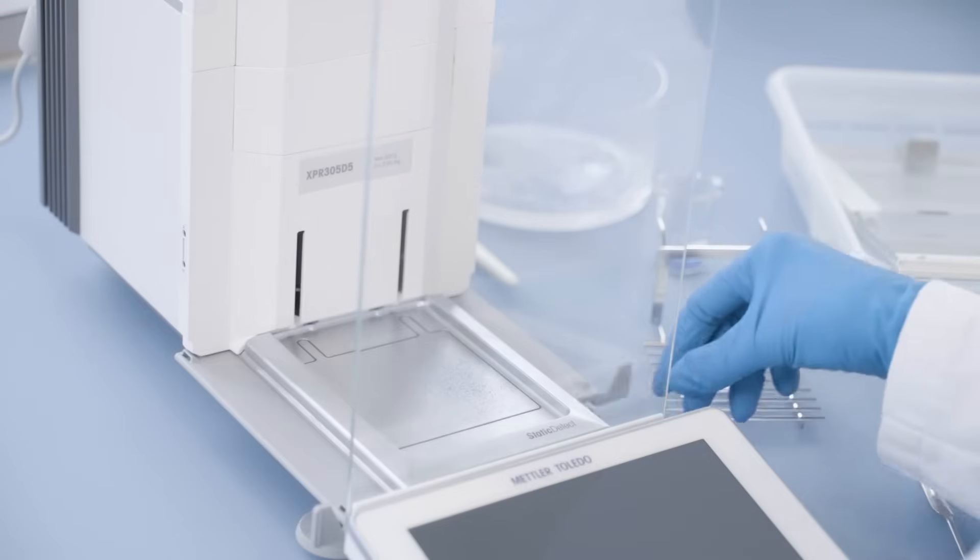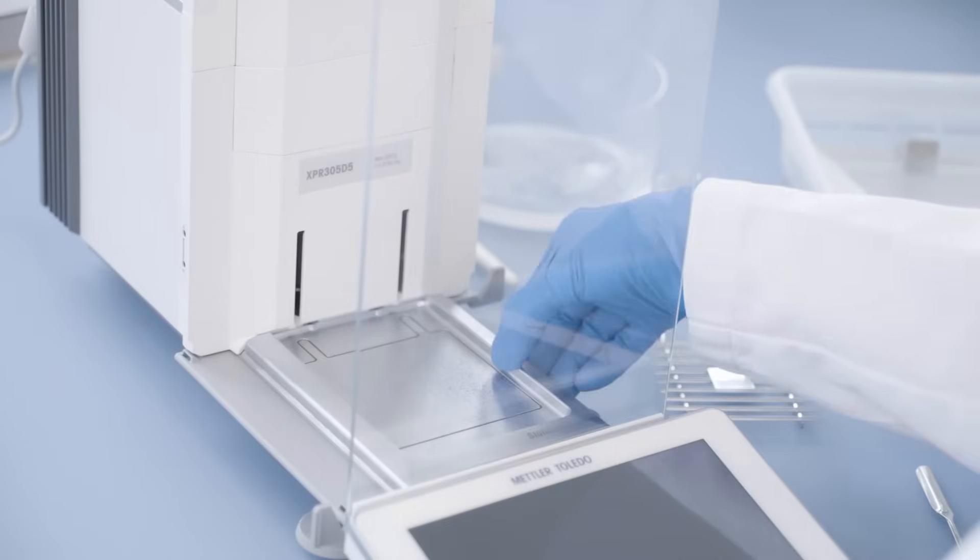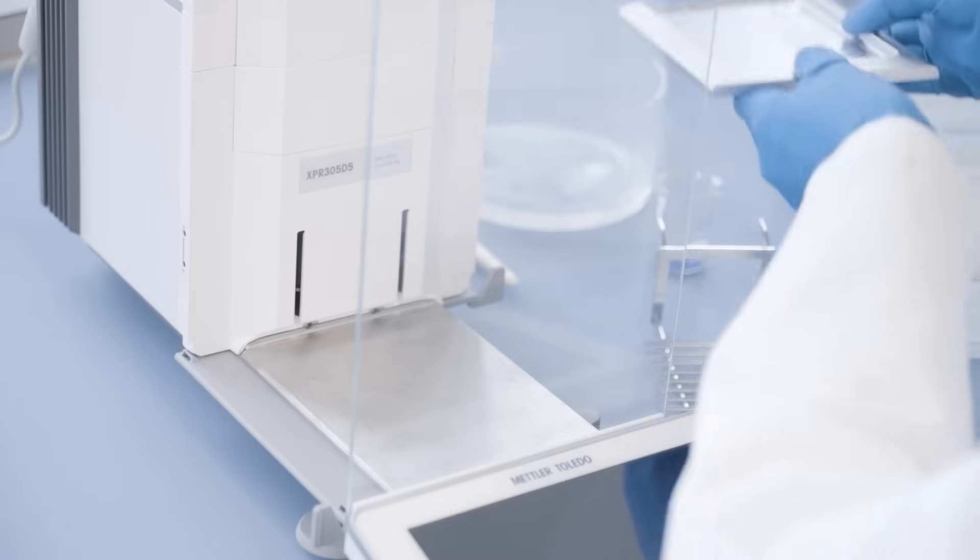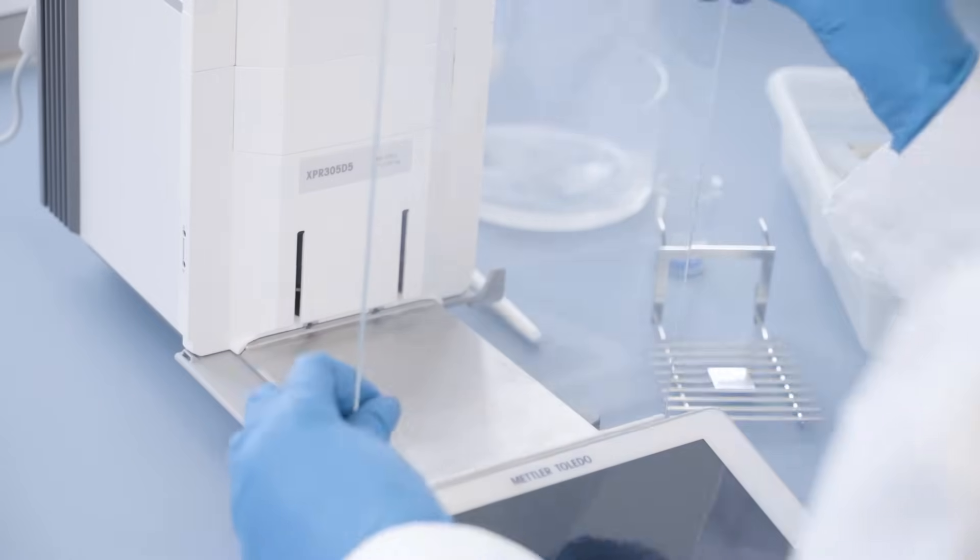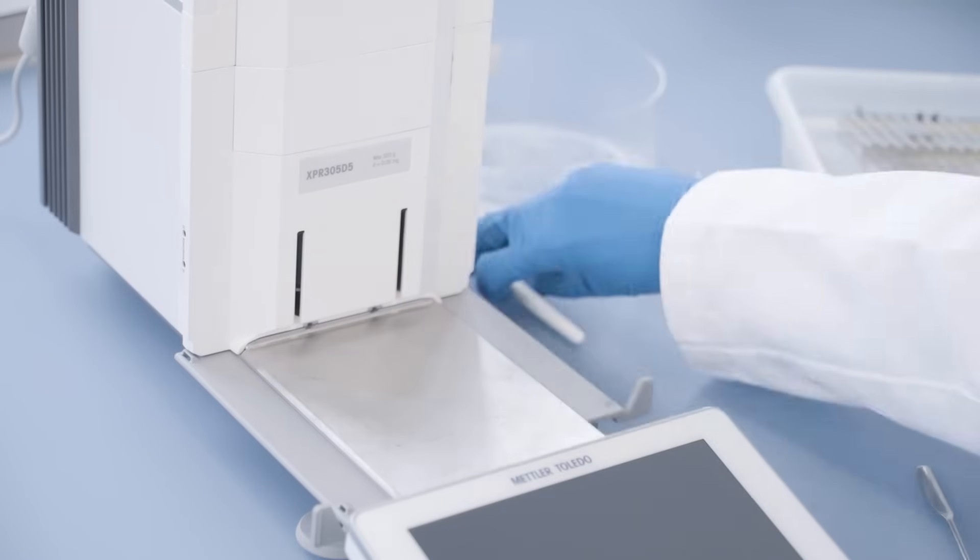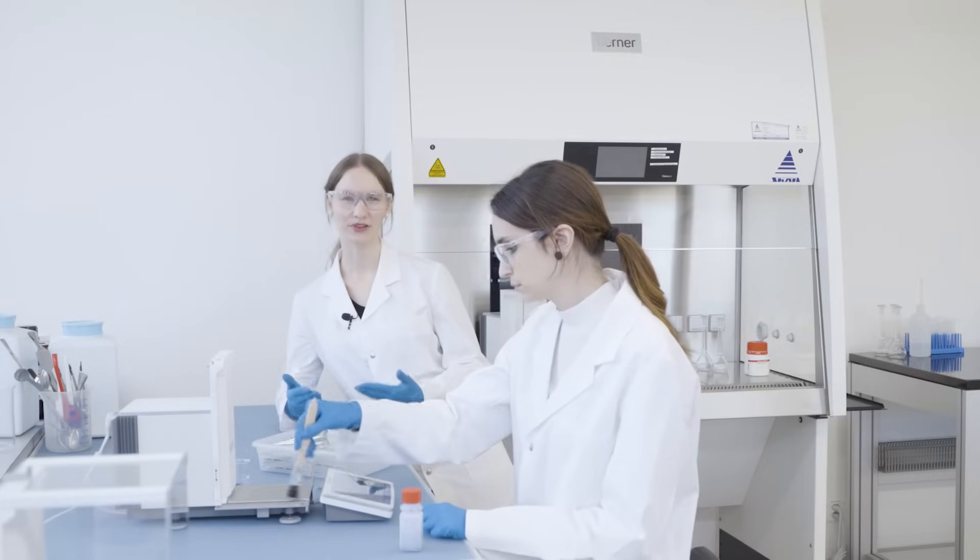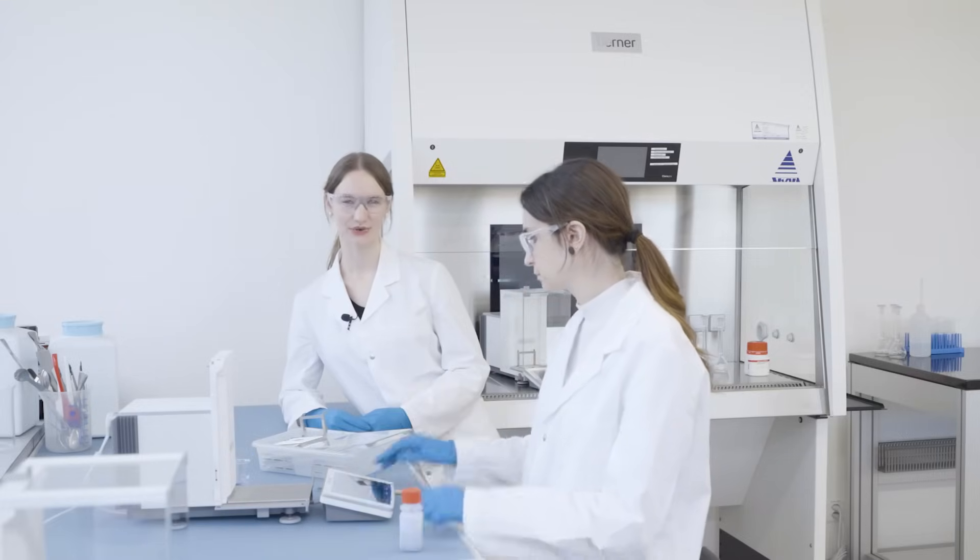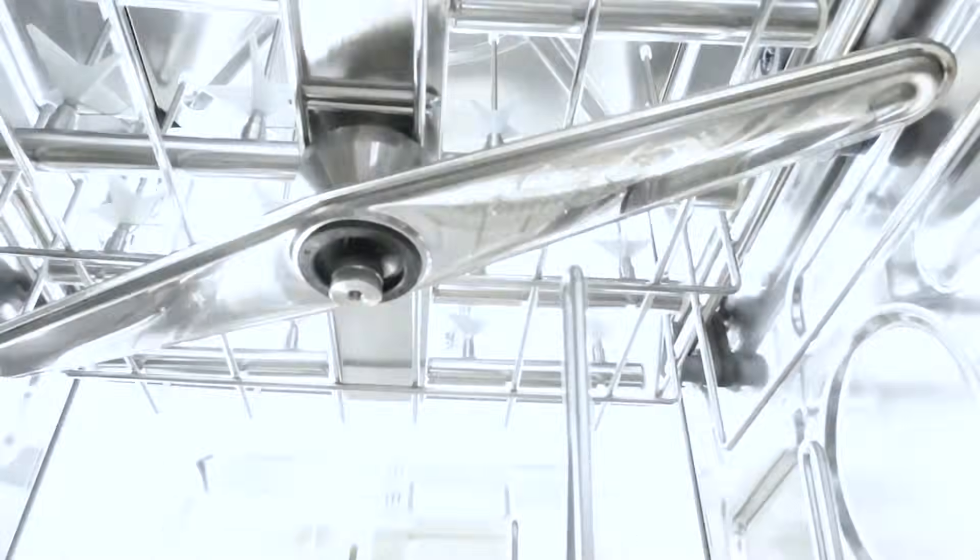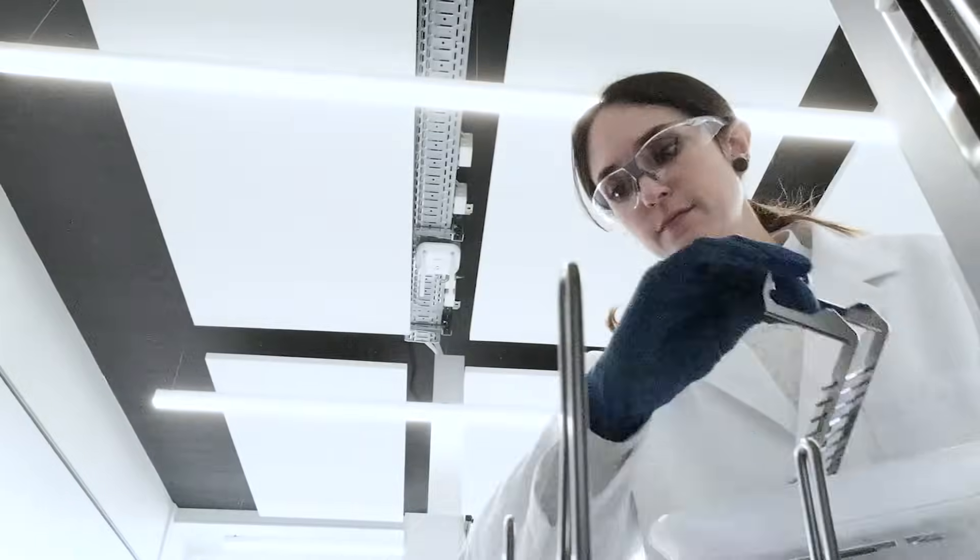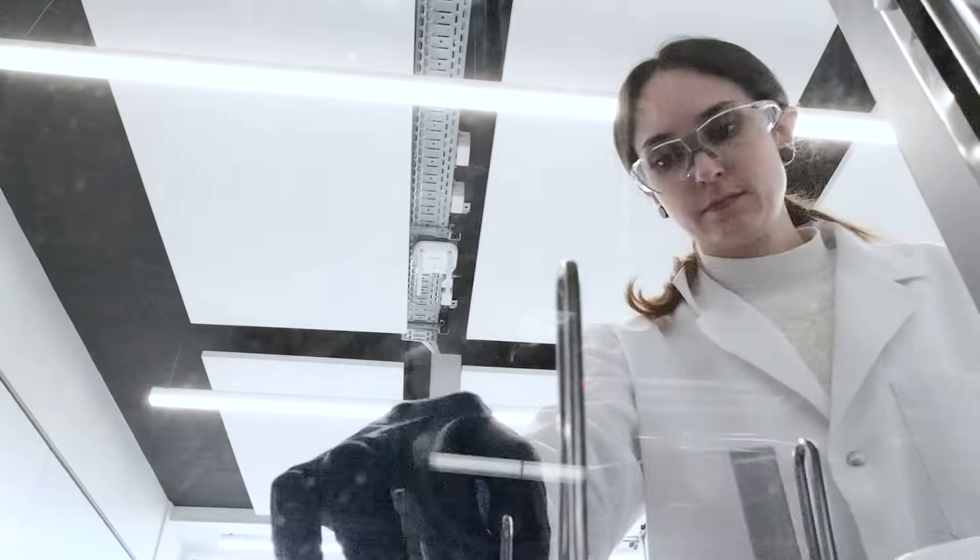The drip tray can be removed without losing spilled sample. The balance is very carefully designed with fully closed flat surfaces. This means sample will not get trapped, reducing your risk of cross contamination. All parts are dishwasher proof. And of course, all materials used are resistant to most chemicals for durability and cleanability.